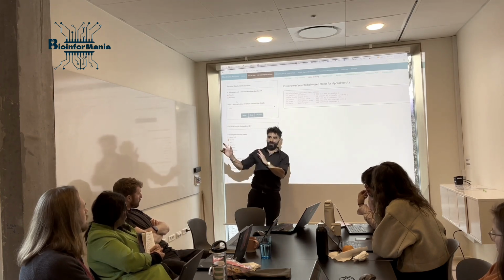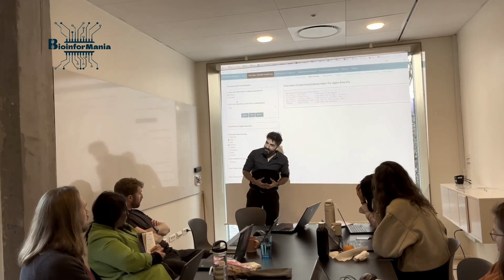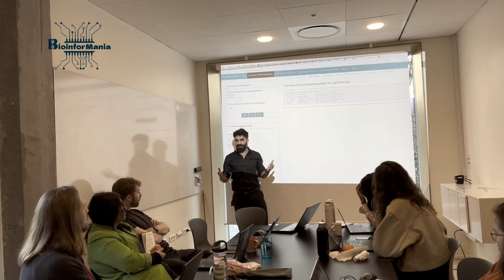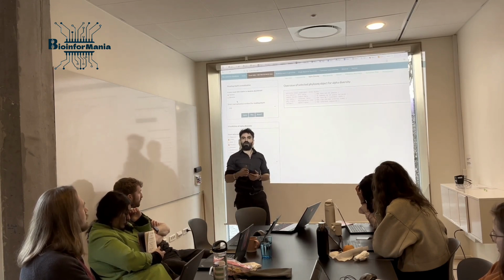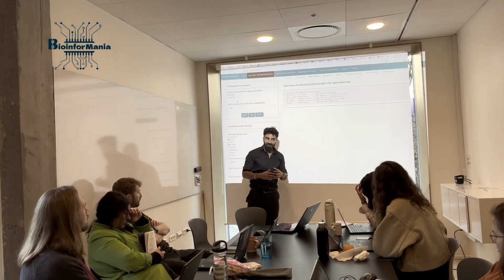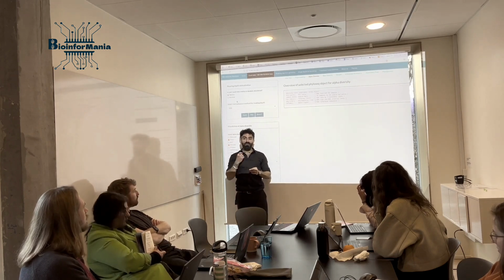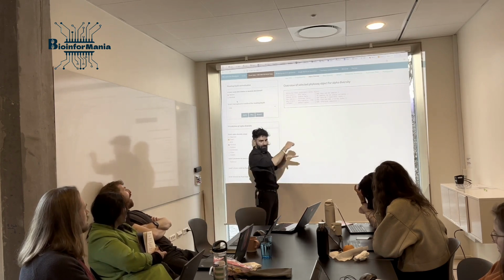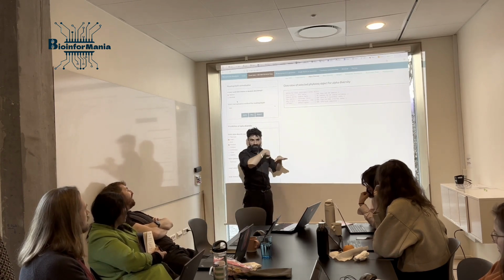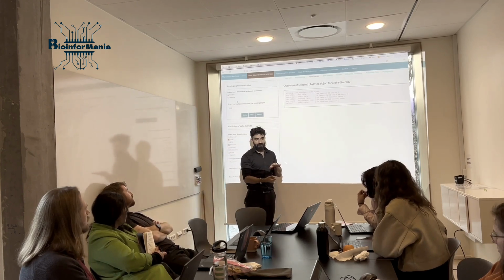If I sequence it, in an ideal world, we need to get the same results. But it doesn't hold in the real world, okay? We have pipetting errors, we have PCR errors. If your library preparation requires PCR, you have many biases. And most importantly is the sequencing machine. In Oxford Nanopore technology, when you have a plate with a lot of pores, about 3K pores, whatever, not every pore has the same quality, okay?